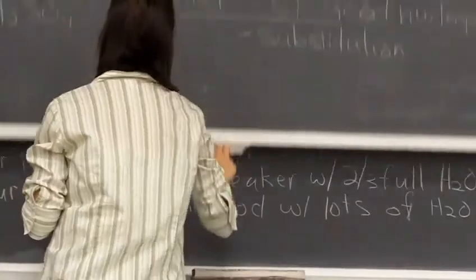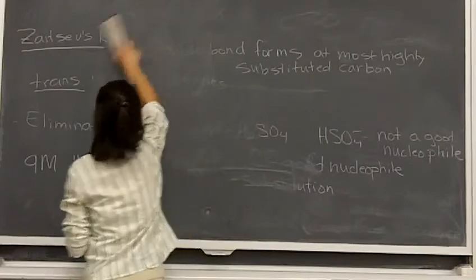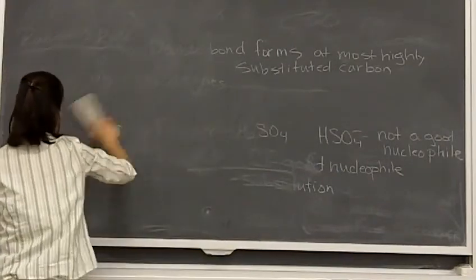Okay. All right, so now let's talk about gas chromatography. And in a minute, you'll see what I mean by retention time.